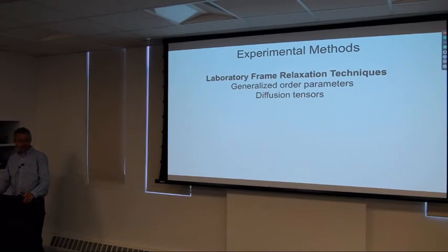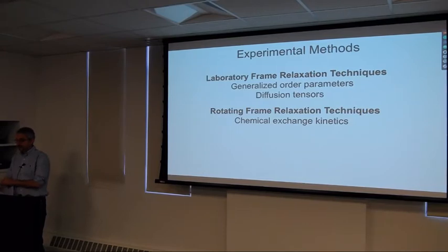And we'll talk today about a series of different experiments. The first will be under the rubric of laboratory frame relaxation techniques. And primarily here, one is interested in what are called generalized order parameters, diffusion tensors, and to a lesser extent in the past, but more in the future, internal correlation times. And then rotating frame relaxation techniques, we're interested in chemical exchange phenomena or conformational exchange. And these split nicely then.